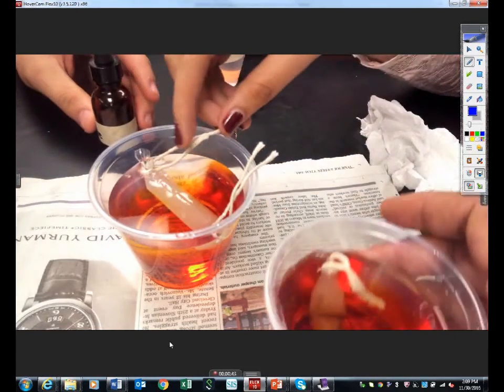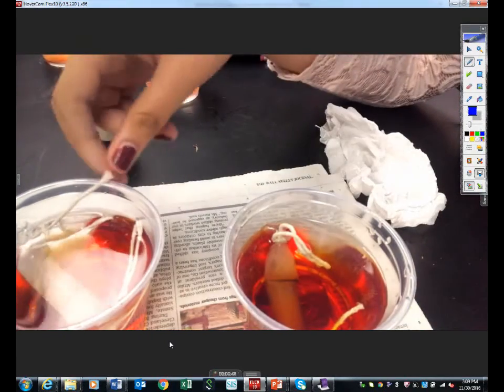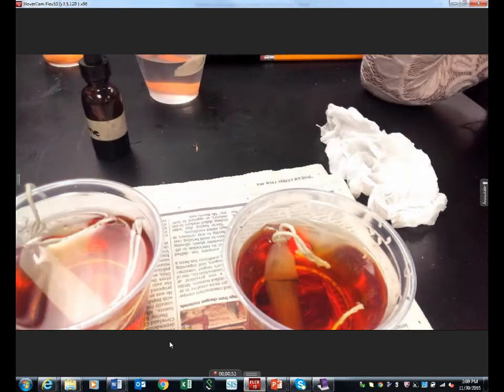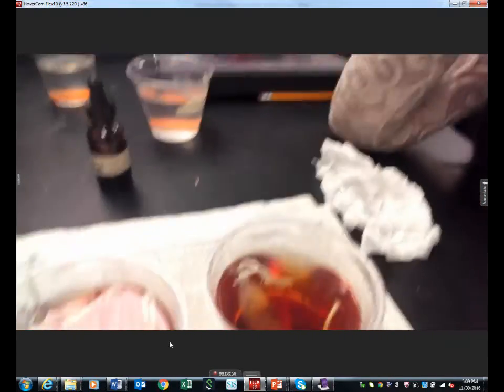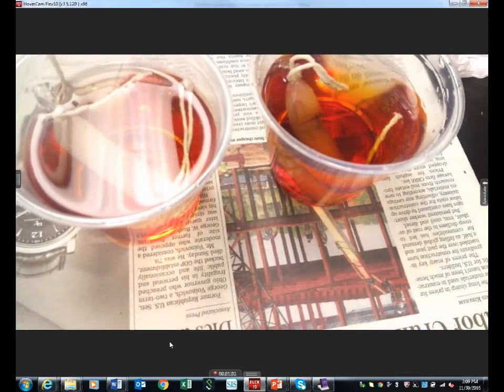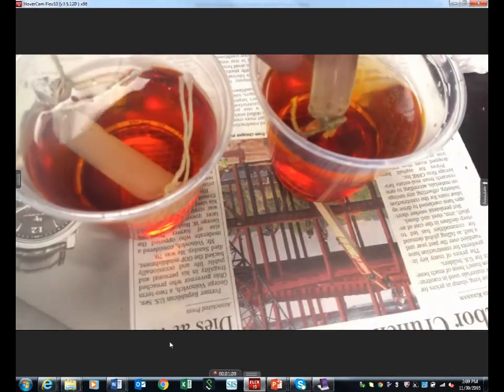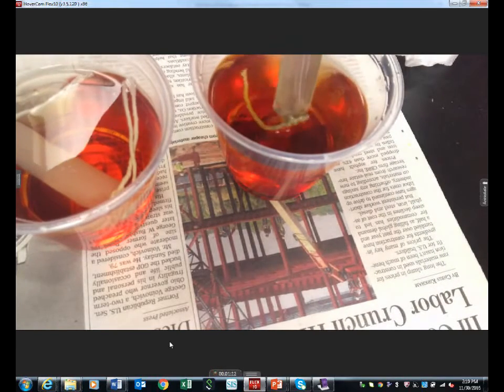They're going to submerge it — this one was already added. Okay, now look, here's what you need to think about. You're periodically going to take yours out. If you look up on the screen, you can already see that iodine is reacting with the starch inside the bag.